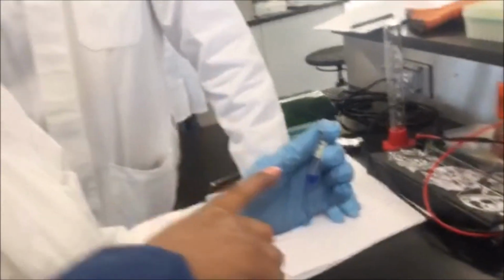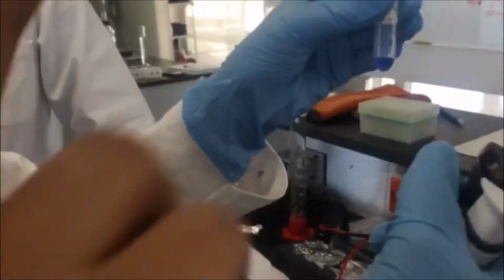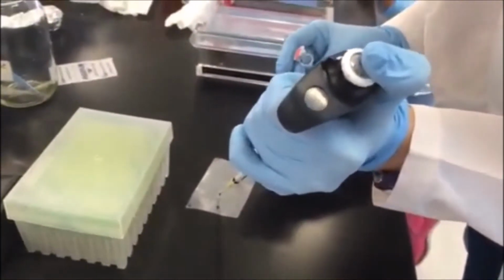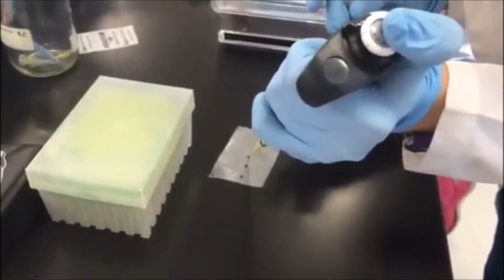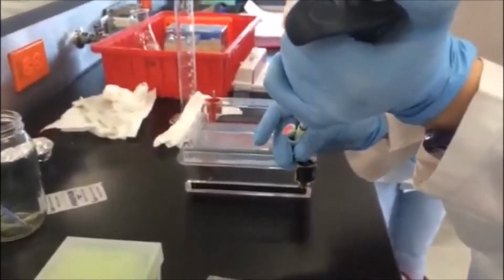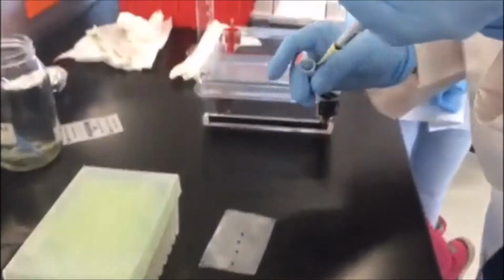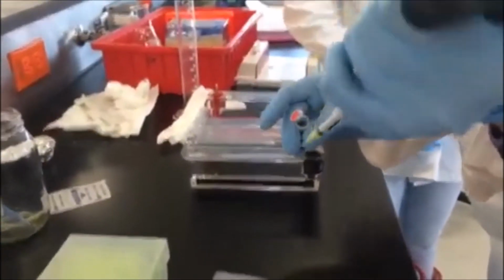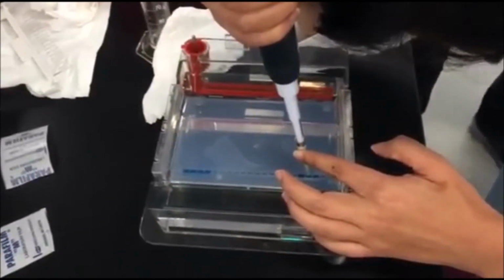PCR product, genomic DNA, plasmid, and the rest are filled with running buffer. 4 microliters of loading buffer were placed on a plastic surface in order to mix with the samples before placing in the wells, except for the first, which is the base pair marker, which already has loading buffer. By micropipetting, the samples are mixed with the loading buffer and then placed in the wells, carefully in order to ensure a correct electrophoresis.